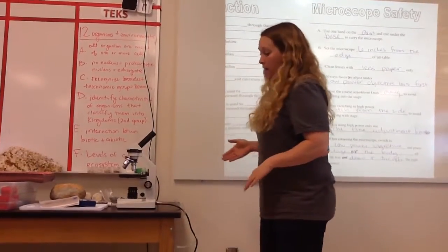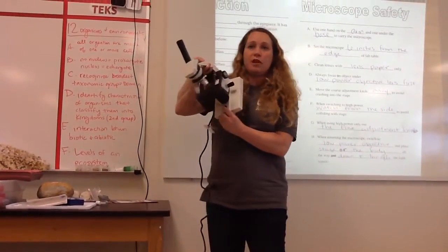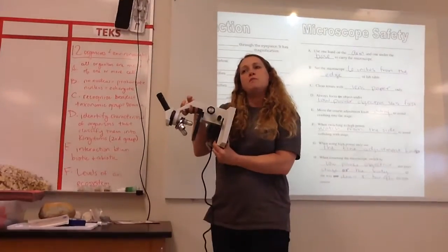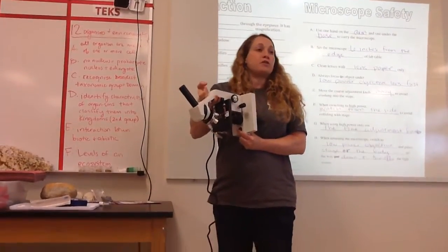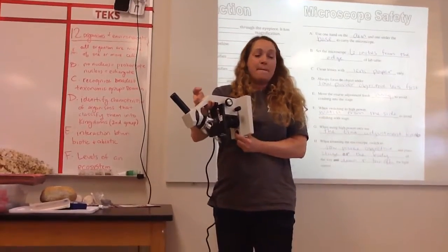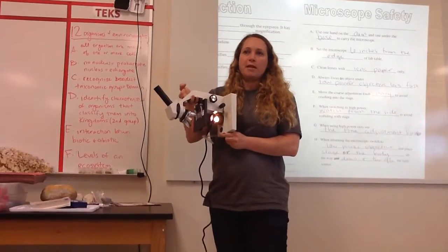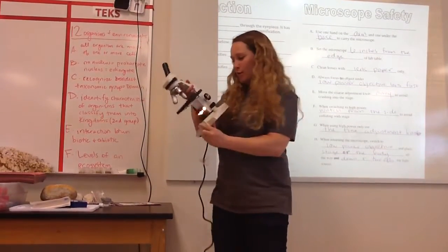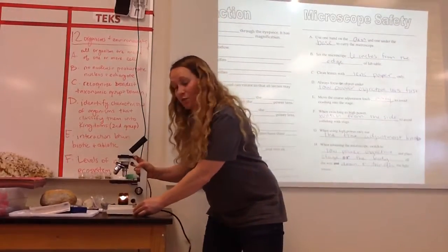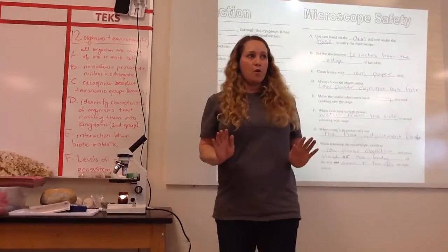Now, it isn't on. There's an on switch right here, or maybe somewhere else on your microscope. It's really easy to turn the light on. So some microscopes have mirrors, and some have lights. Ancient microscopes were all mirrors because there was no electricity back then. But today, we're really lucky because it's a lot easier to use a light bulb. Boom. That's it. It's on. To turn on? Yeah. That would have been embarrassing. Okay, so it's on. It's away from the edge. The slide is in place, and I'm good to go.